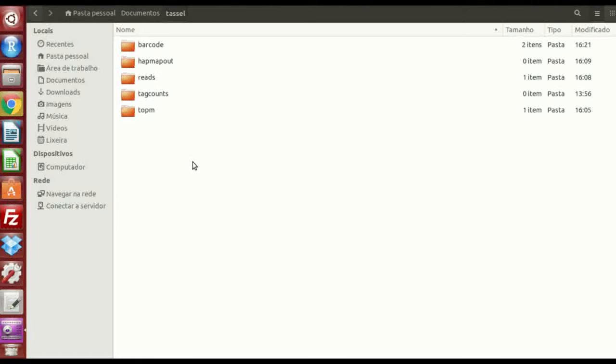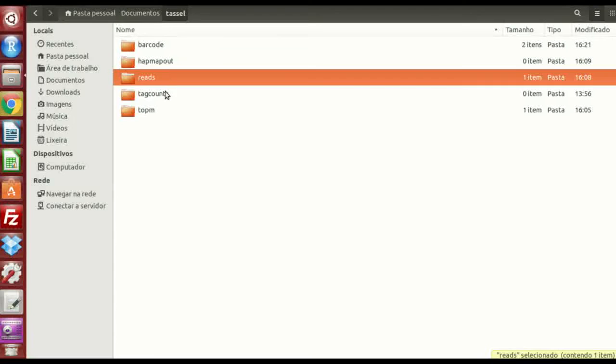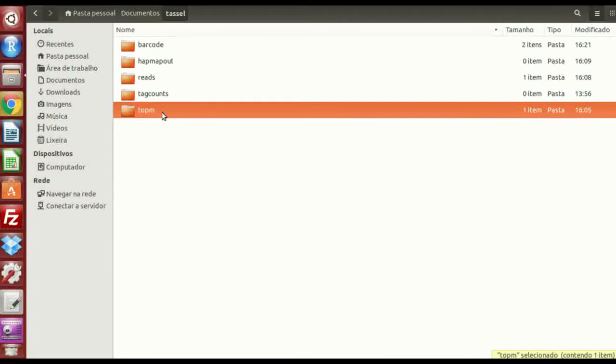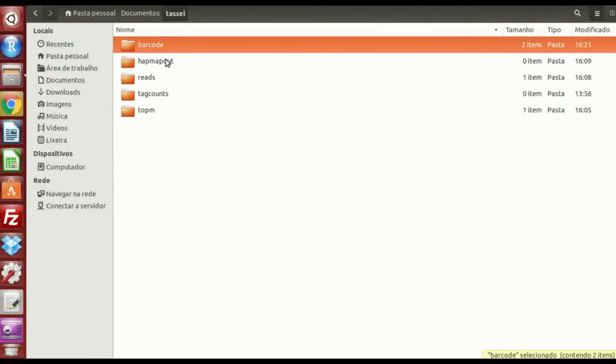The first thing we have to understand is that we have a setup of files to use. I'm going to show you the files I have and how they have to be arranged.